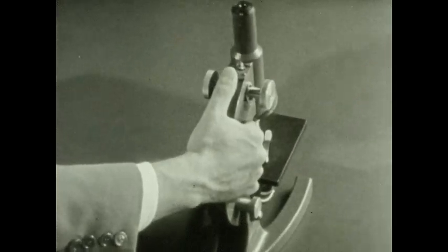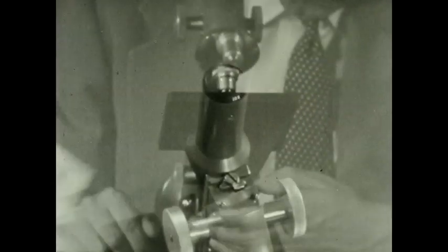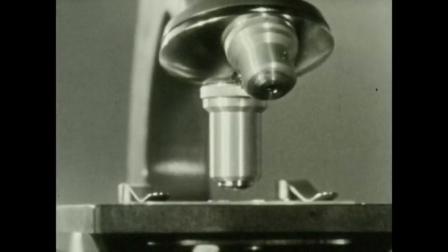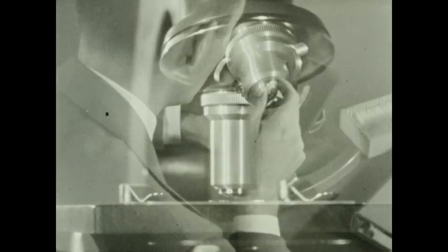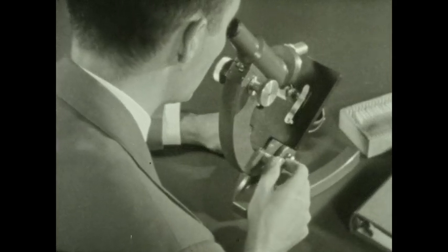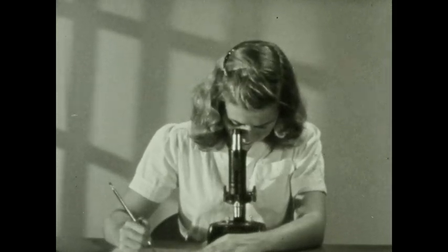Handle the instrument carefully. It is delicate and expensive. Keep the lens surfaces clean with lens tissue. Adjust the mirror for even, comfortably bright light. Carefully adjust the objectives to a position near the slide. Then focus, first with the coarse adjustment, and complete the focusing with the fine adjustment. And learn to keep both eyes open while studying the specimen.